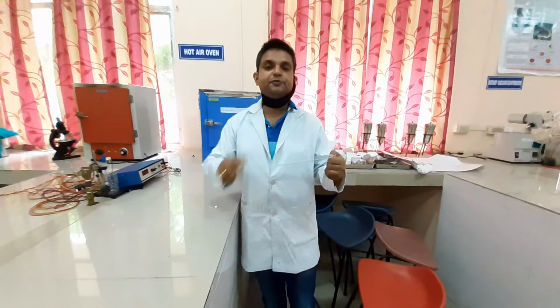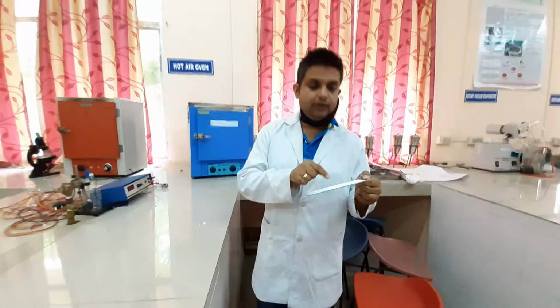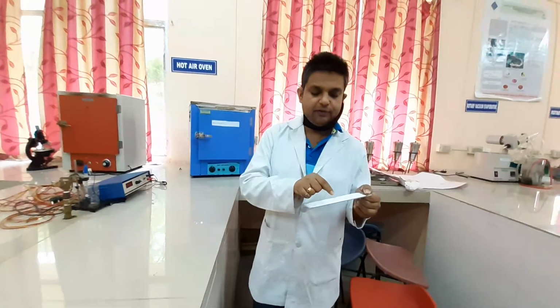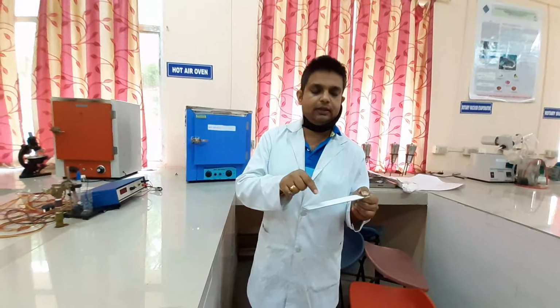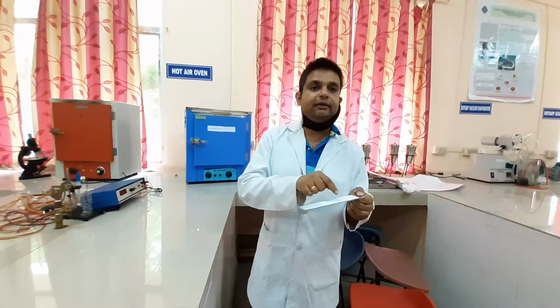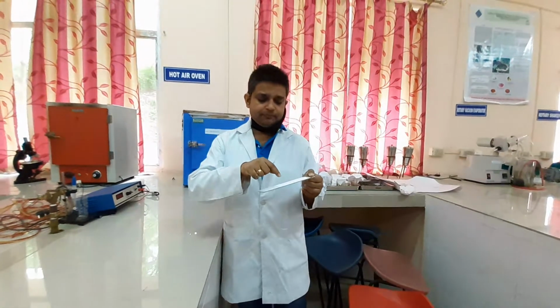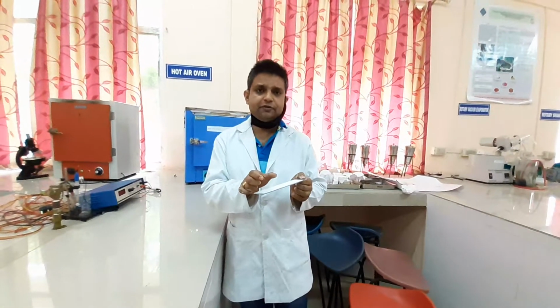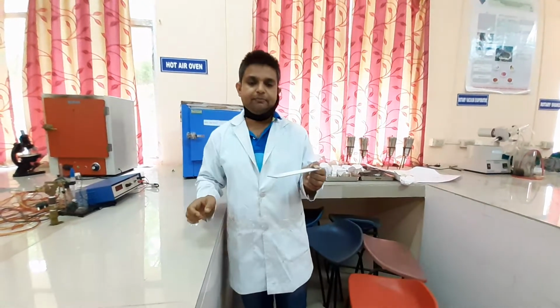Now if we spray here, then we can find the violet spots. Here you can find in the standard only a single spot, whereas in case of the test compound we can find at least 3 spots. Now match the Rf value of the standard with the Rf value of your test sample.